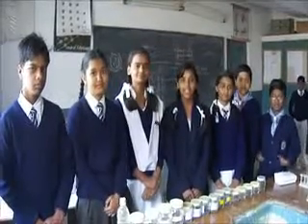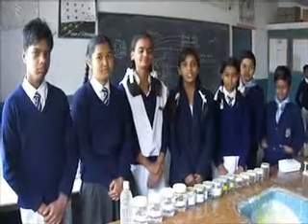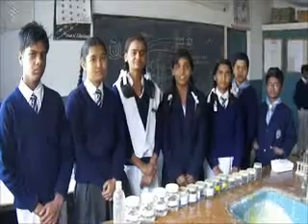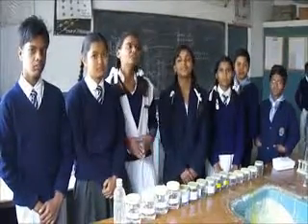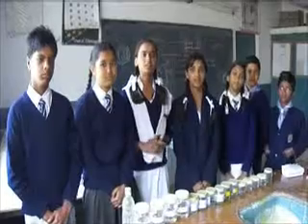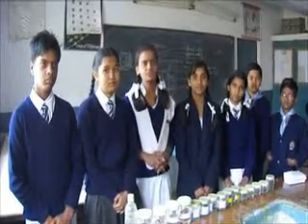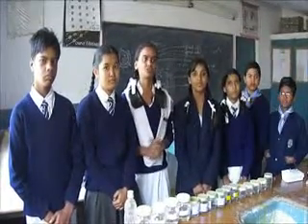By a survey, it has been noticed that in India, groundwater contains a large amount of fluoride. But how is it possible that fluoride reaches the groundwater? When water seeps into the ground, it dissolves many substances, depending on the soil and the rocks through which it flows. Fluoride compounds are among those substances and hence dissolve in the water.